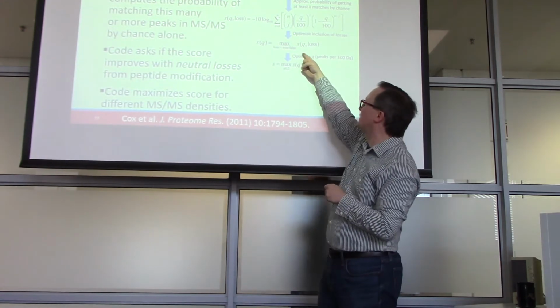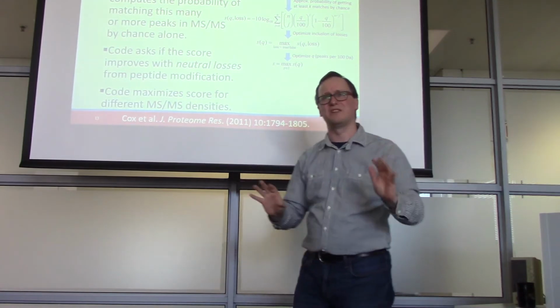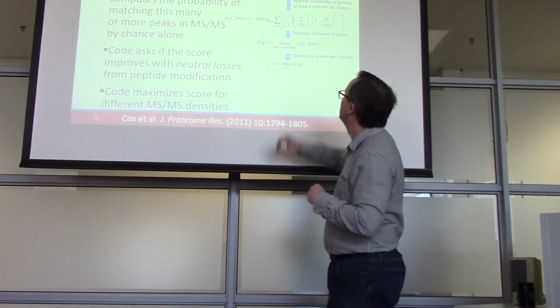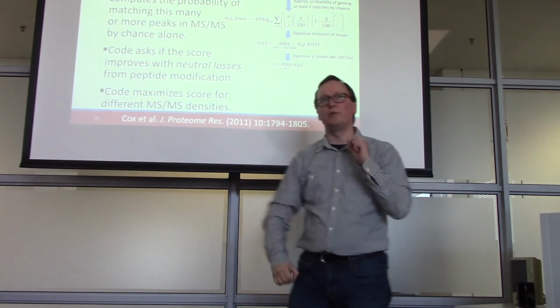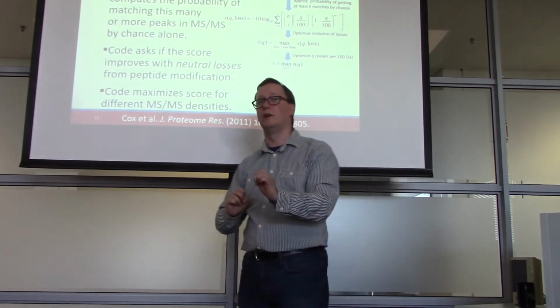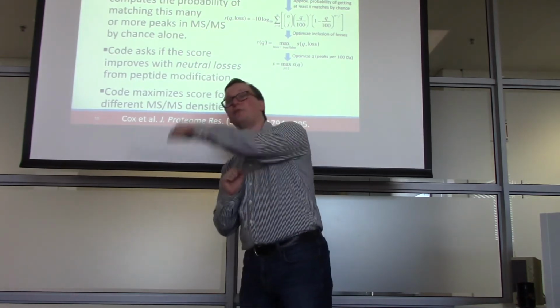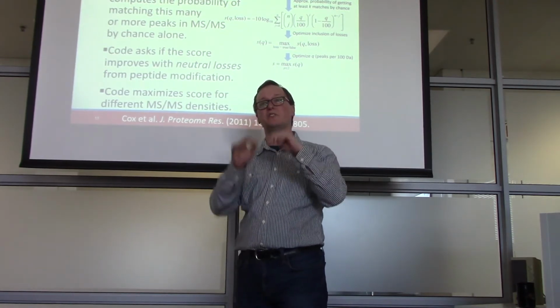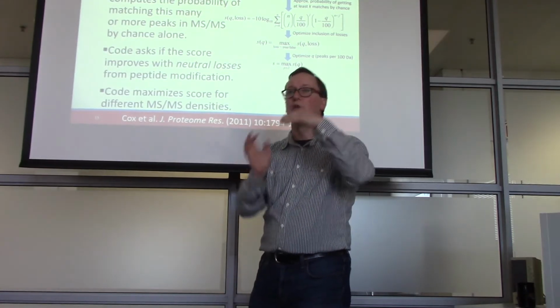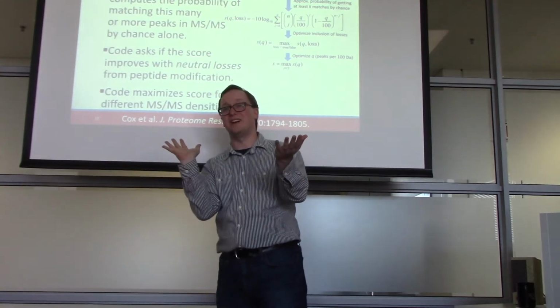It also does a little bit of optimization, and these are kind of not really statistical perspectives, but they're an additional spin on this. So the first is that the software realizes that certain kinds of post-translational modifications that we look for, like phosphorylation on serine and threonine, can lead to extra fragments showing up. So the software scores such peptides two ways. One in a case where the loss doesn't take place, and one in a case where it does.